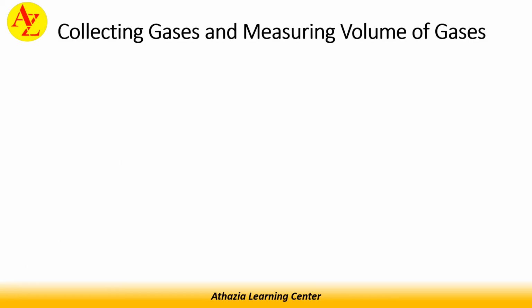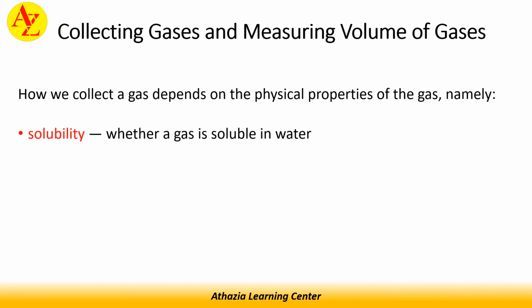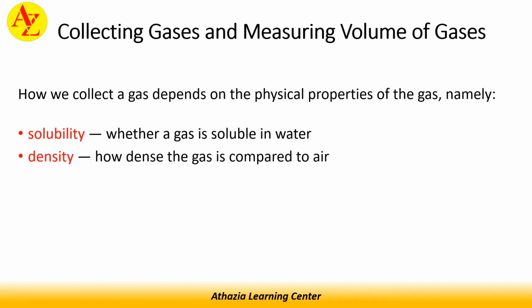Collecting gases and measuring volumes of gases. How we collect a gas depends on the physical properties of the gas, namely solubility, which is the solubility of a gas in water, and density, how dense the gas is compared to the air.